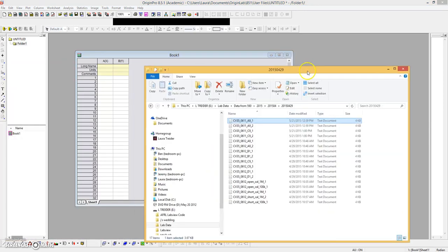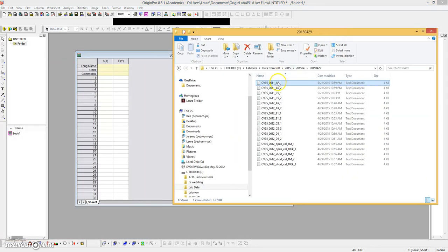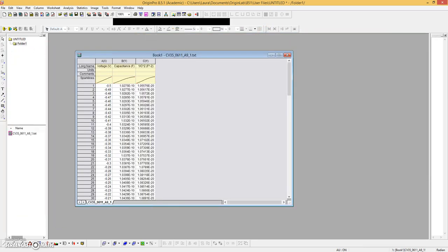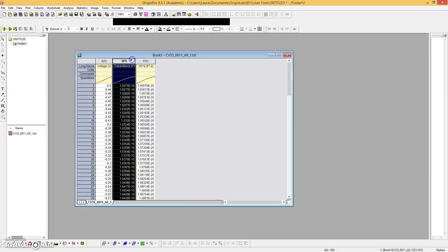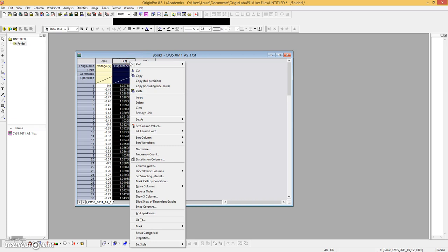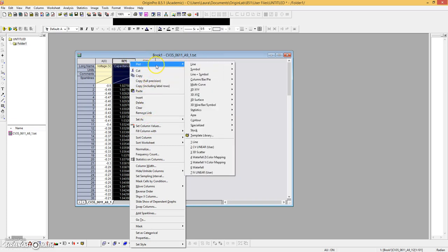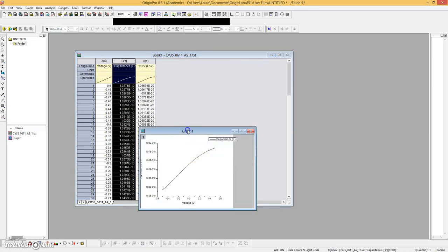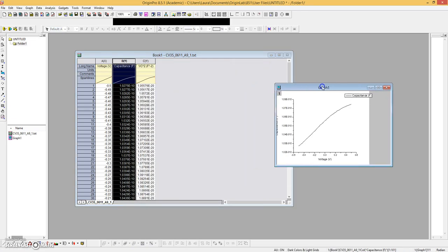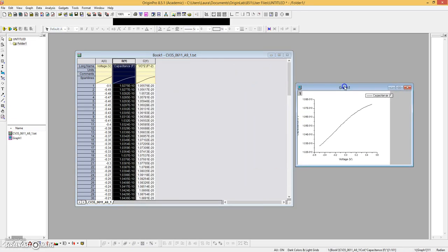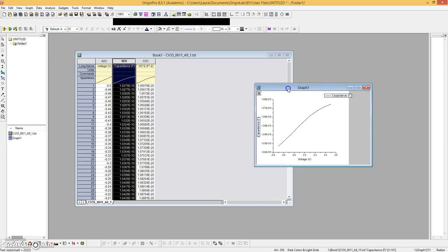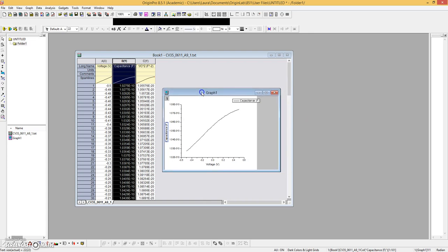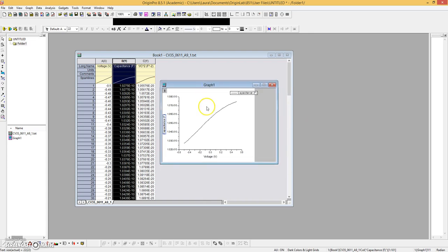So I'll just add some arbitrary data in here and mess with it a little. None of it's very important, so try not to focus on what I'm doing with the data—we'll just focus on the batch processing aspect of it. So here's a CV curve. It's not a very pretty plot. I'm going to pause this recording real quick and make this pretty and come back.